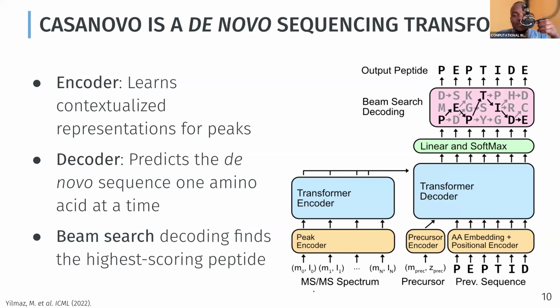So we have looked at the spectrum while you were starting this discussion, but I'm missing the translation of how to encode this input. How is it input, these sequences of token-like inputs, the M naught, I naught, into the peak encoder, but also the precursor, what differentiates it from these other tokens? I'm seeking some more clarification on that input layer, so to say.